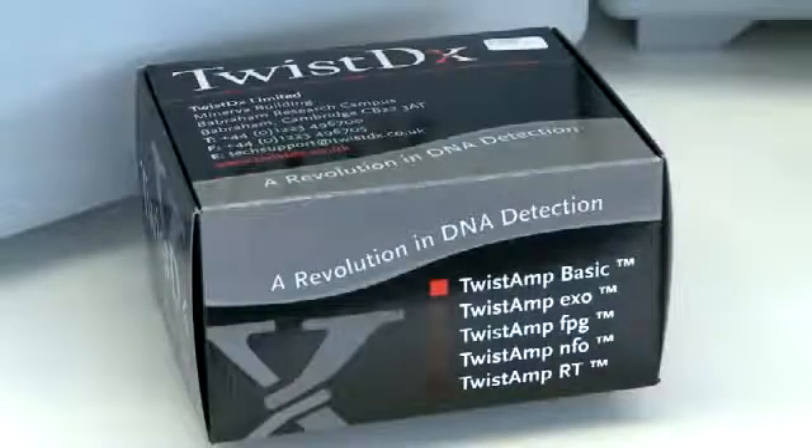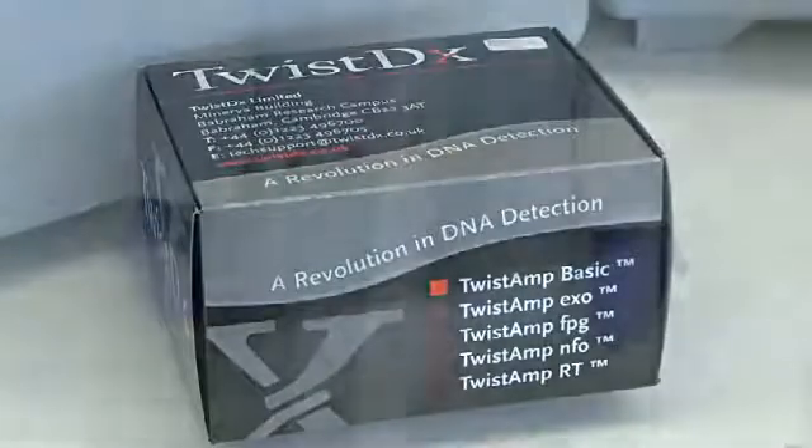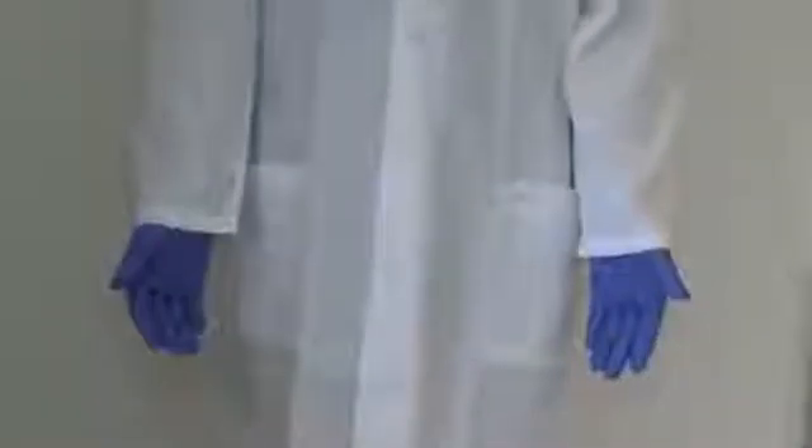TwistAmp Basic Kit. Before starting, please ensure that you're wearing the correct protective garments required for your workplace.